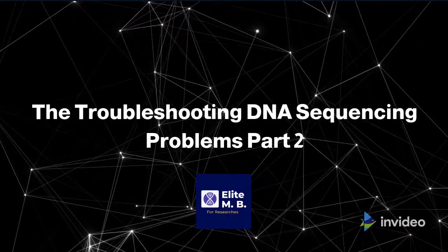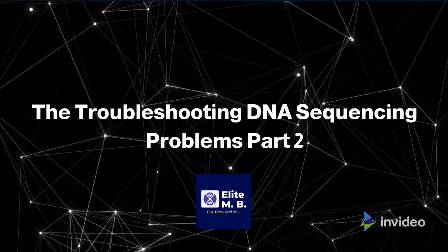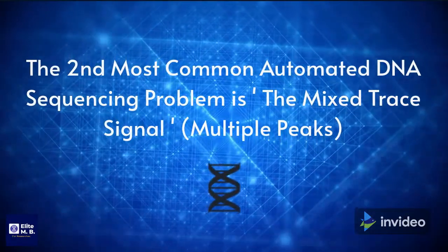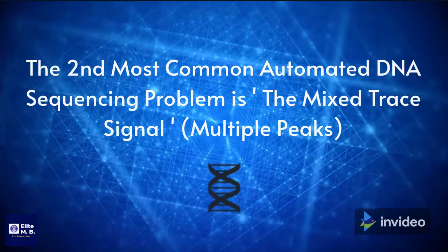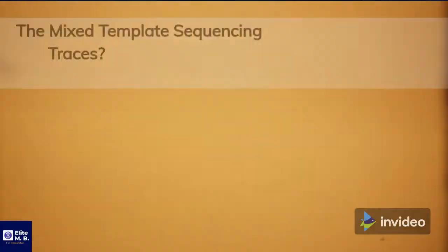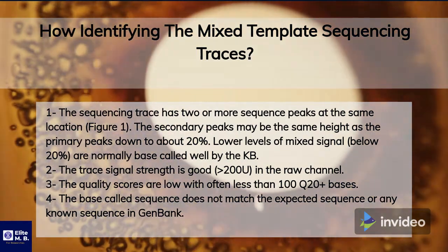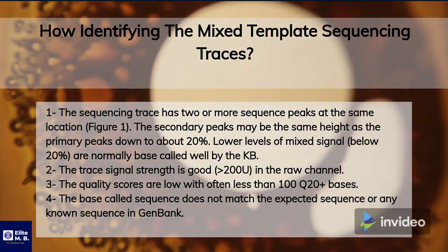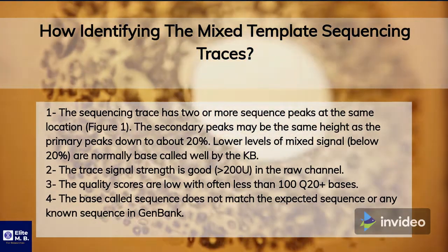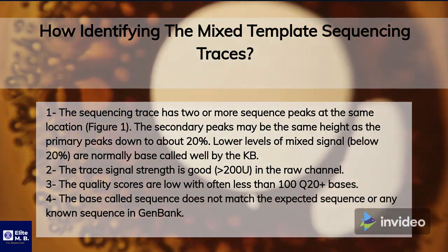Troubleshooting DNA sequencing problems: the second most common automated DNA sequencing problem is the mixed trace signal, or multiple peaks. When identifying mixed template sequencing traces, the sequencing trace has two or more sequence peaks at the same location. The secondary peaks may be the same height as the primary peaks, down to about 20%.